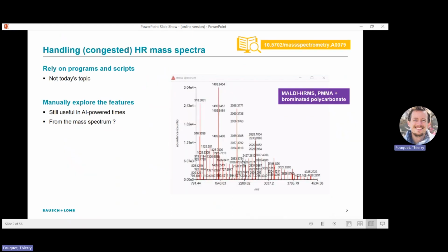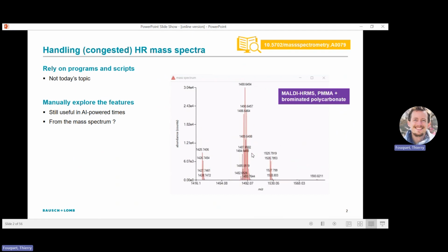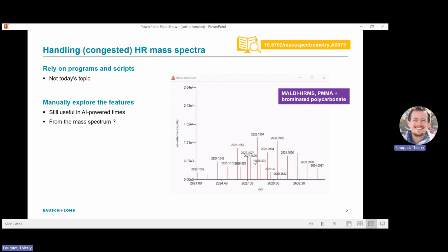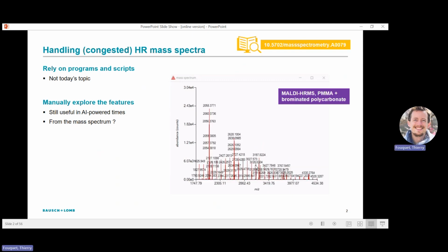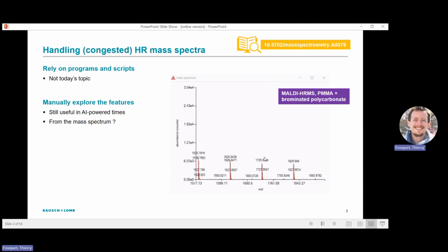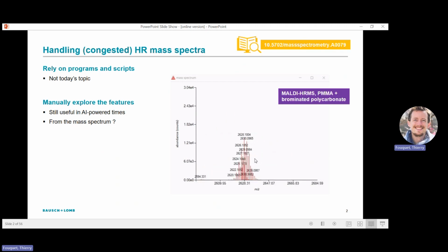Okay, so very briefly, the idea behind these plots is just that we all know that the main drawback of mass spec, and especially high resolution mass spectrometry, is just the number of peaks that we are facing in every single mass spectrum. If you look at any very basic, very typical mass spectrum of a polymer, you will have hundreds or thousands or sometimes millions of peaks to potentially assign or at least understand.